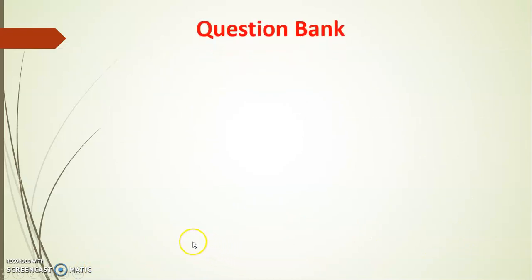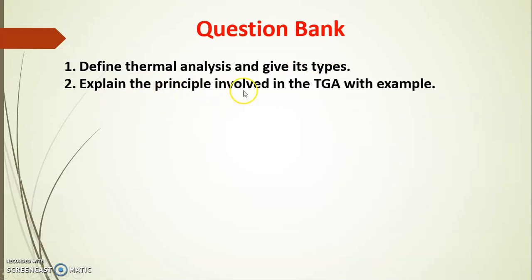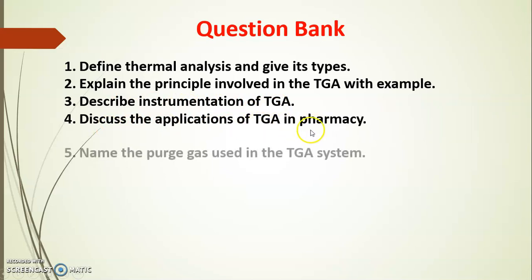So this is about the applications. Now the next part is the question bank related to the TGA technique. Some questions are: first, define thermal analysis and give its types. Explain the principle involved in TGA with an example. Next, describe the instrumentation of TGA. Next, discuss the application of TGA in pharmacy.